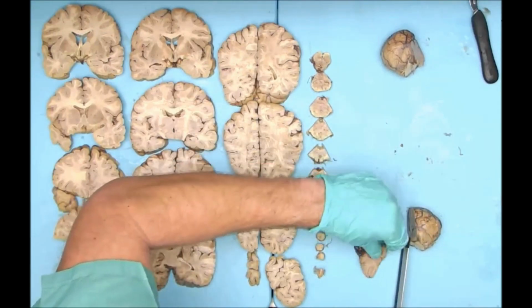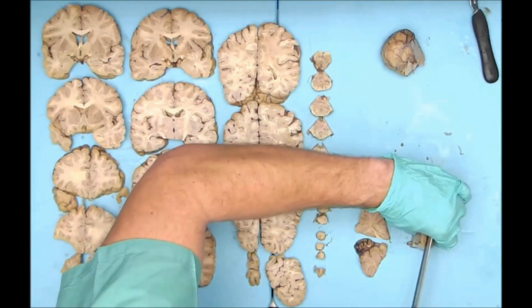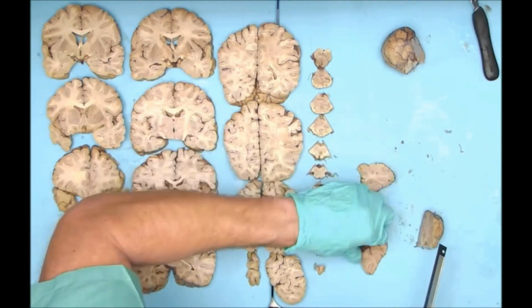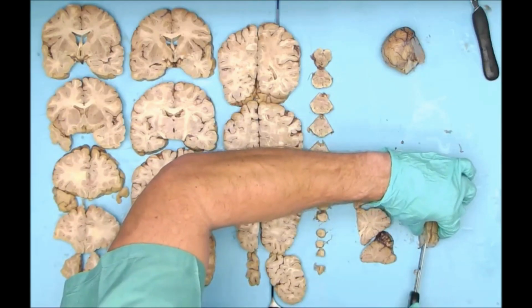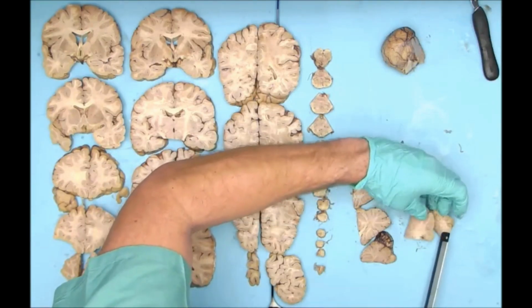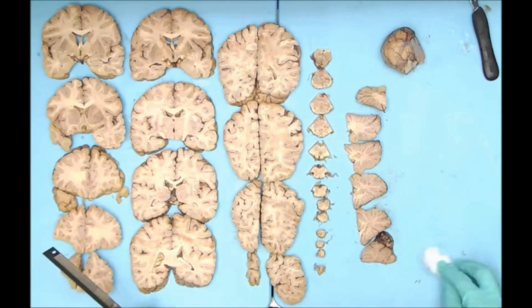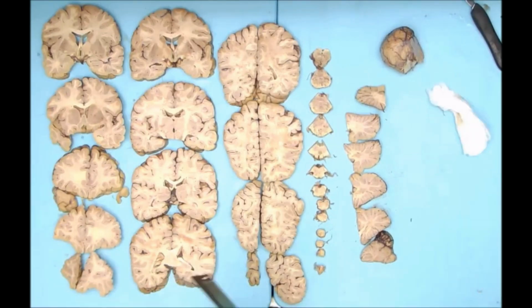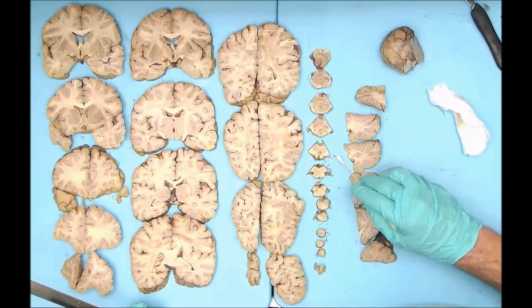And what I try to do is put these in sequential order as well, but I make sure I try to make the same number of slices on the right side as the left side, as you can see here. Once again, clean up the cutting board as I move on, so I can make this worthy for photo documentation.